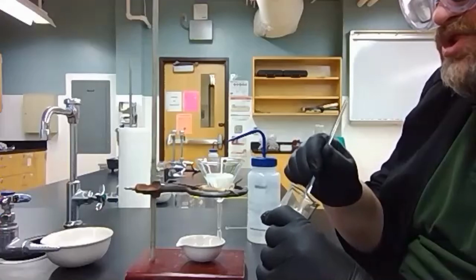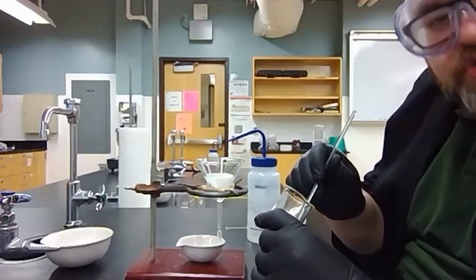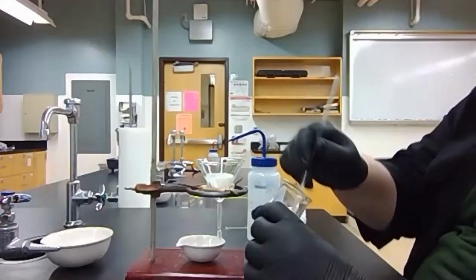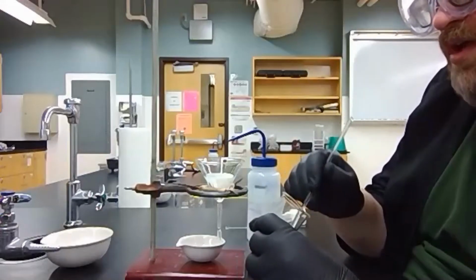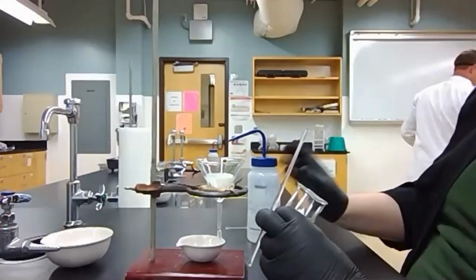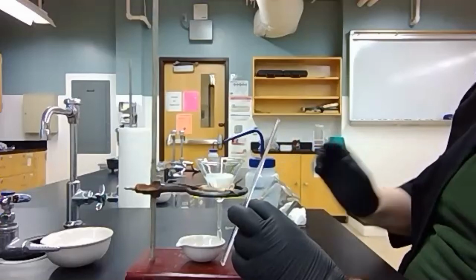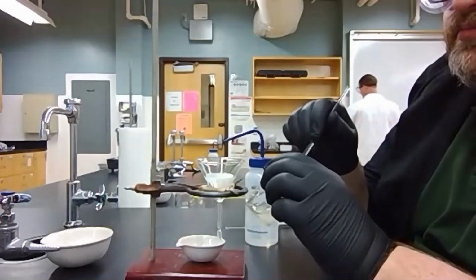I'm going to continue doing this and mixing it. You don't want more than about 10, 15 mLs at the most of water in here. And I'm at about 5-ish right now just by eyeballing it. So I can still add a little more, and I need to. The water's still cloudy. We're going to keep mixing here.